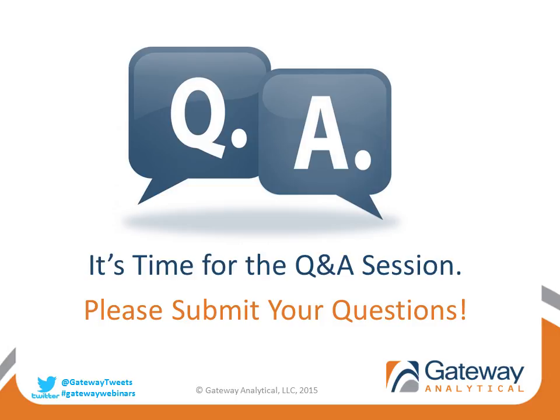Okay, great. Thank you, Dave. Next question. So what is the advantage of buying a library rather than creating one with in-house particles? Time and money. Yeah.